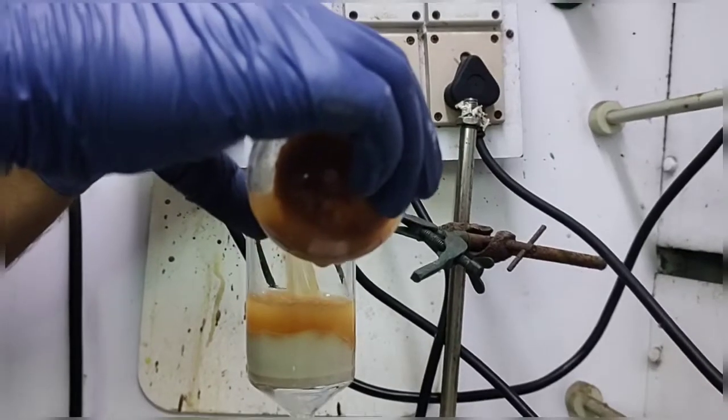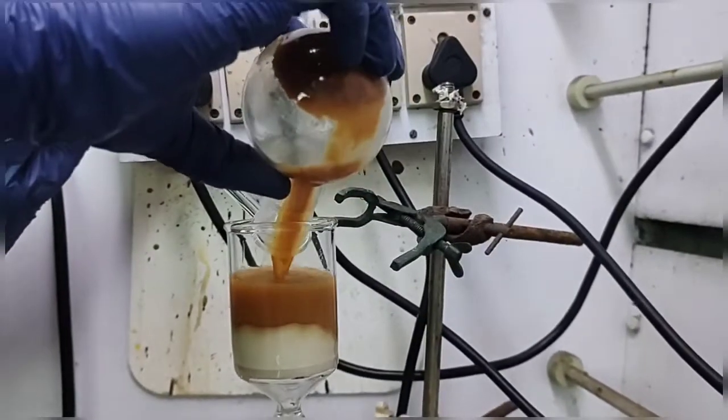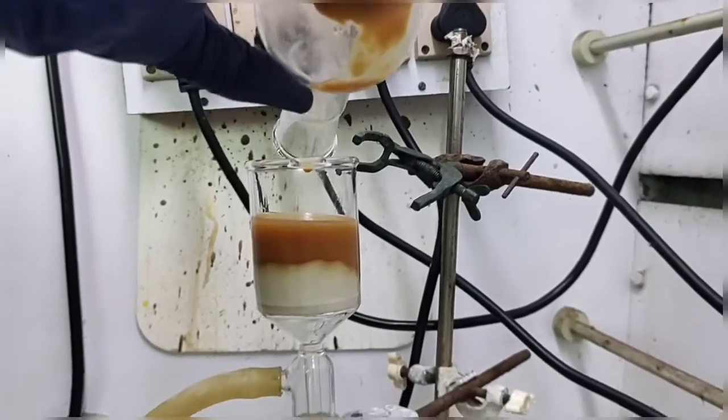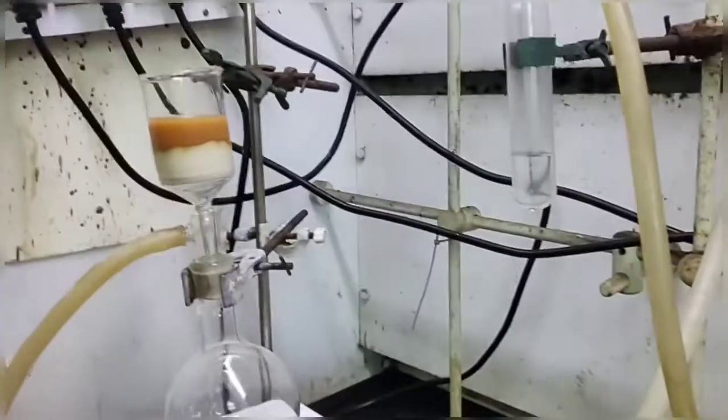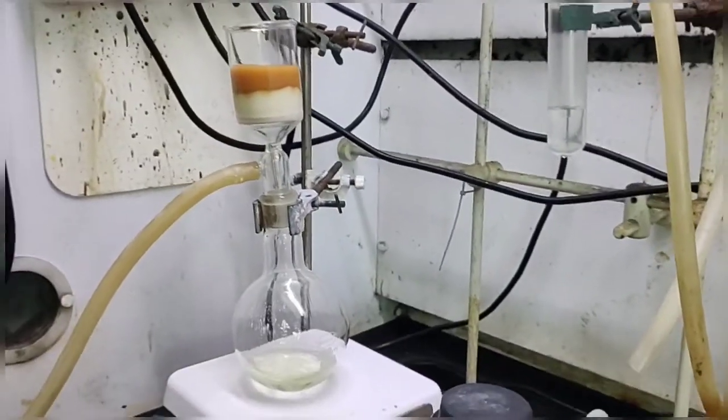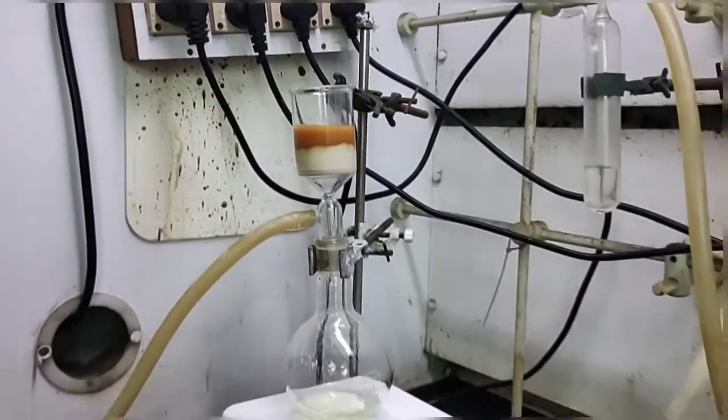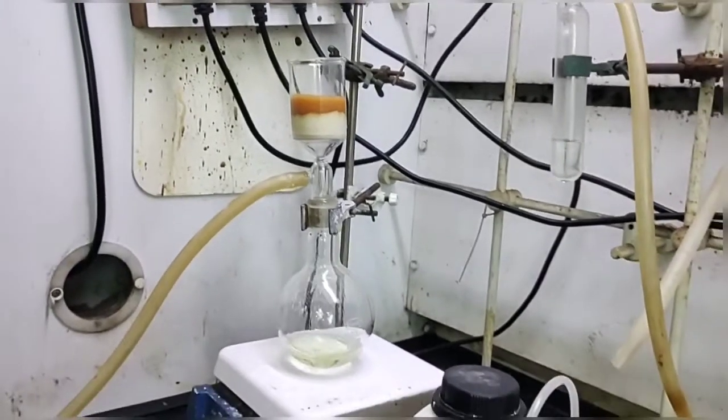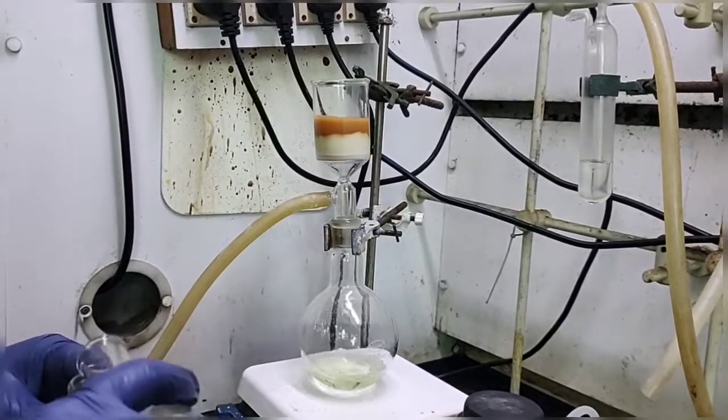Slowly we are pouring our reaction mixture into this sintered funnel and vacuum is being applied to it. You can see that the filtrate is coming down under the vacuum pressure and the filter is being stuck over the silite.